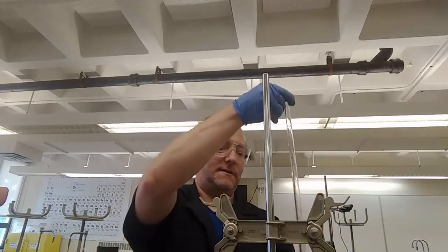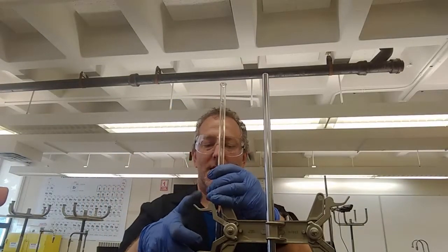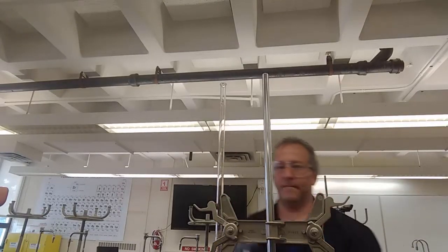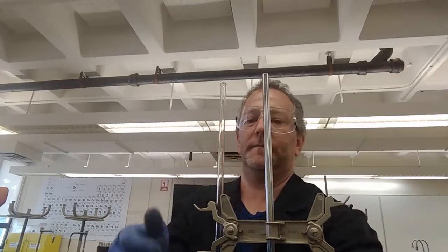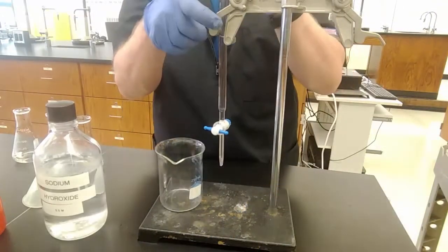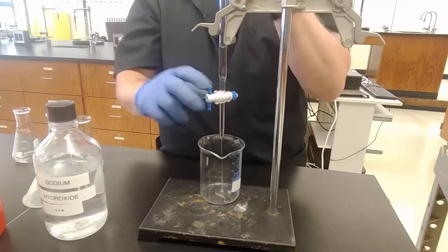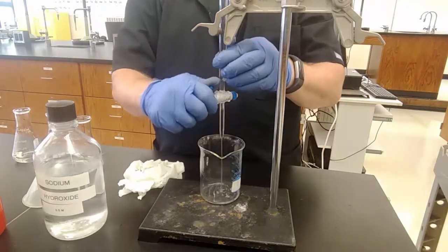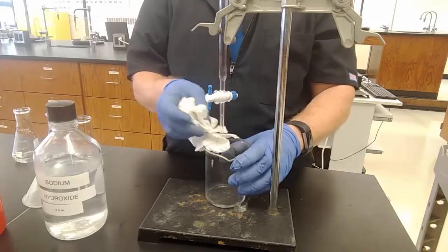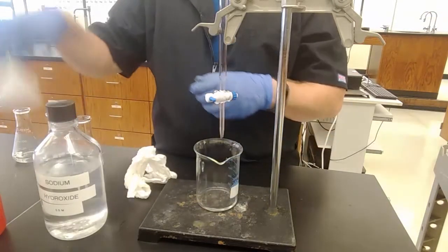Then I'm going to trash this base now that I'm confident that my glassware is clean. So, just a waste beaker. And I let the base almost all the way drain out. Yeah, I might as well let it drain all the way out. Why not? Okay. If I have any air in this tip, once I've filled it, not allowed.